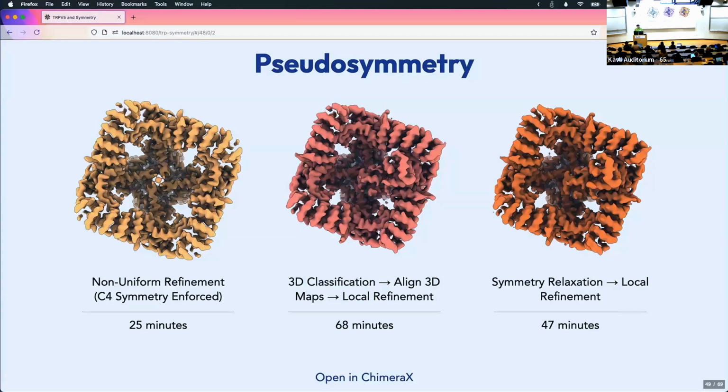What we found, and what Relion and other software often do, especially with smaller particles or worse signal to noise ratio, is that if you smear particles a bit over the orientations, figure out the probability of the particle being from each orientation, and then back project with that, it helps prevent overfitting a little bit and makes the algorithms a bit more stable. So in non-uniform refinement, since this job is usually used for smaller proteins with more disorder, we turn the marginalization mode on by default.